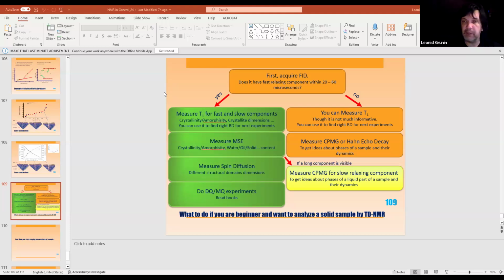Then when you start measuring T2, of course, you have very fast decaying, and there's nothing you can do with this. And it has different T1. But maybe you don't register it. But even for the long component, it has different T1. The long component of the T2 has different T1 from the short component. But it will be mono-exponential for T1. It will be bi-exponential for T2. That's because the ranges are very different, and somehow the exchange might happen.